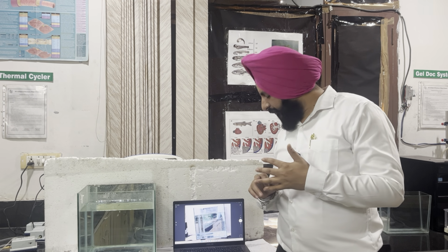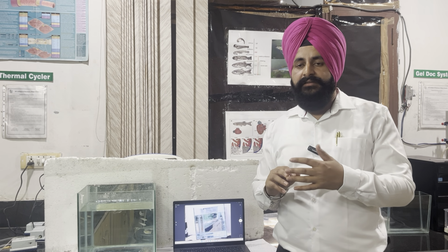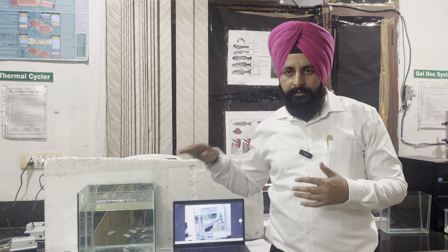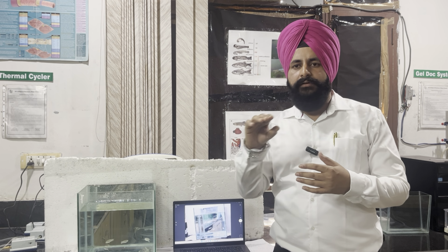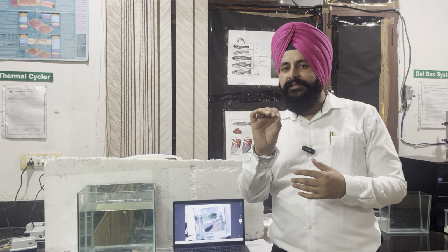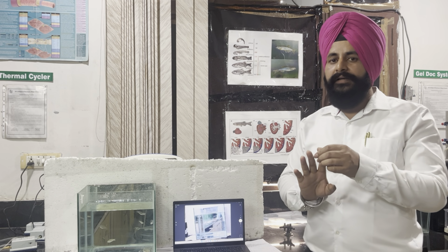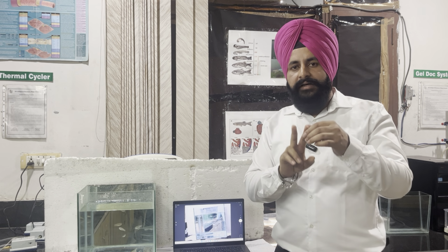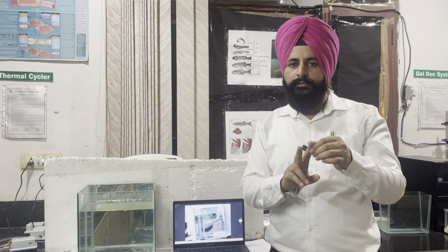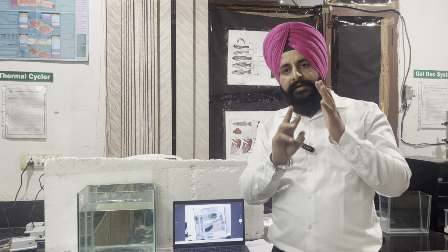And the fifth sign is gasping. Gasping is the condition where the fish travels on the upper side of the water, on the top layer of the water, and opens its mouth. The opening of the mouth is a sign that the fish is feeling hypoxia. So these are the parameters you will calculate while inducing anxiety-like behavior, acute and chronic: acute for 7 days, chronic for 14 days in zebrafish.